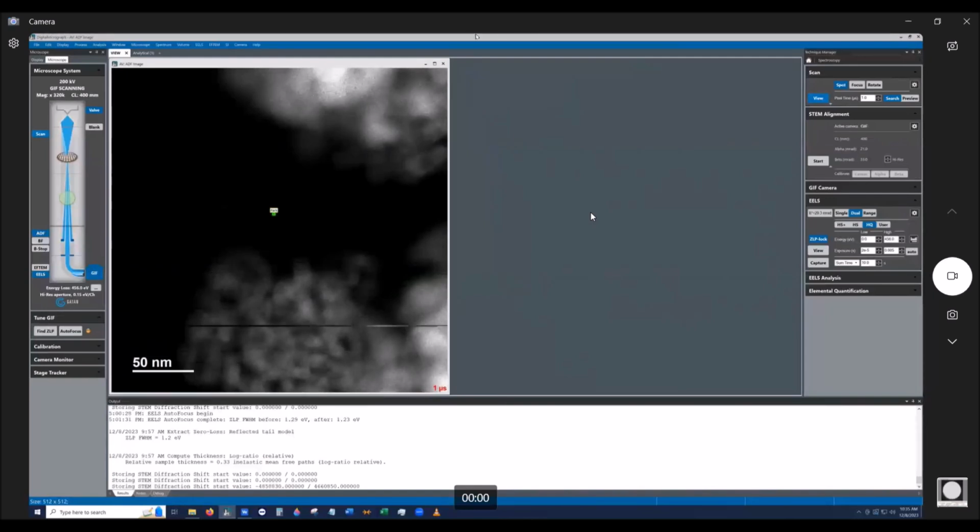One other thing I forgot, I'll go back and show you this later. You want to make sure you have Descan activated when you're doing this. That will make sure that you don't see shifting. Well, actually here, I can actually show you this here.